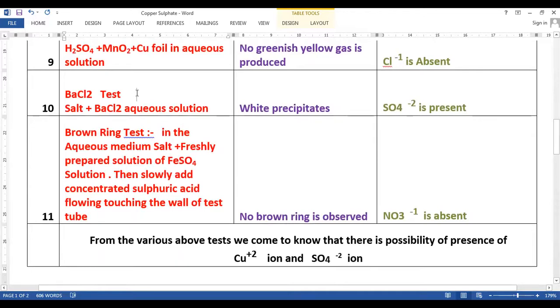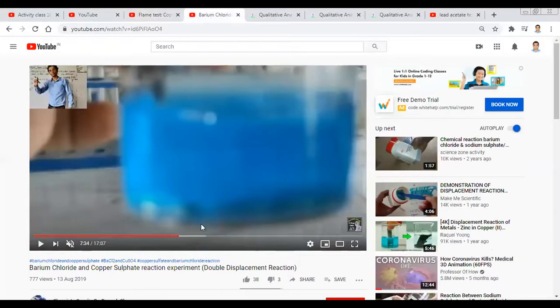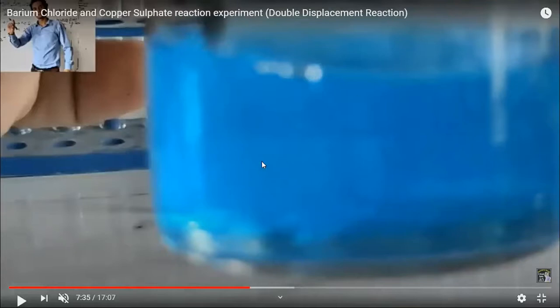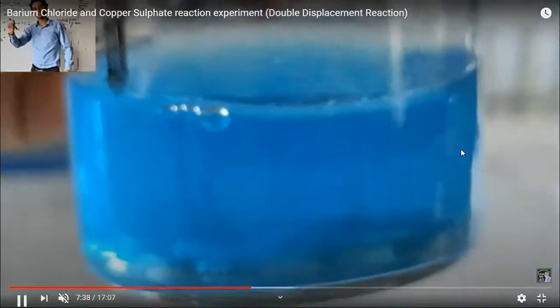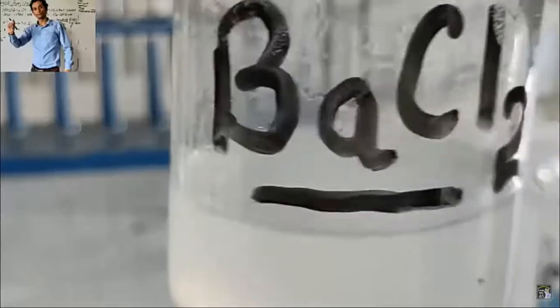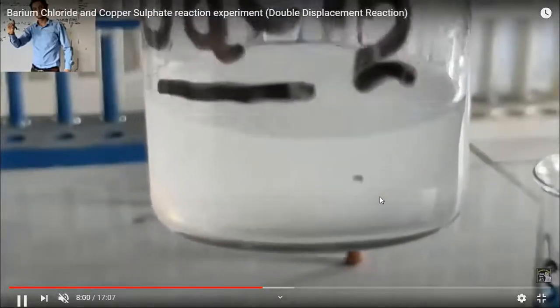The next test we are going to perform is the BaCl₂ test, also known as the barium chloride test. Let us perform the barium chloride test. You can see here we have the solution of the given salt which is blue in colour — it is the aqueous solution. We also have another solution — this is the solution of barium chloride.